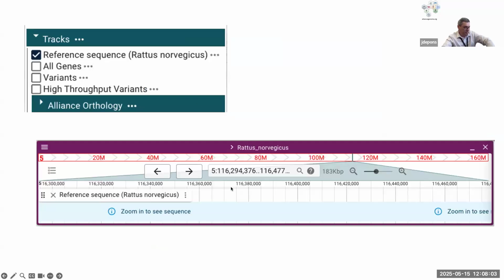So if I select that, I wanted to put this slide on here as well. Another common UI component of JBrowse is if you try to open a track that has too many widgets for the screen. This is all in JavaScript running in the client browser. So there are times when it'll ask you to either zoom in or to force load. And I just wanted to point that out.